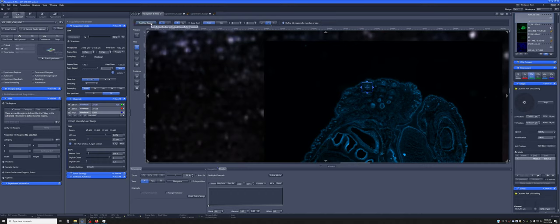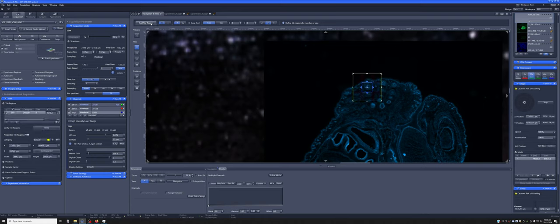If I press this add tile region, it will add a graphical representation of this 3x3 object and it will add this tile to this list of tile regions here.